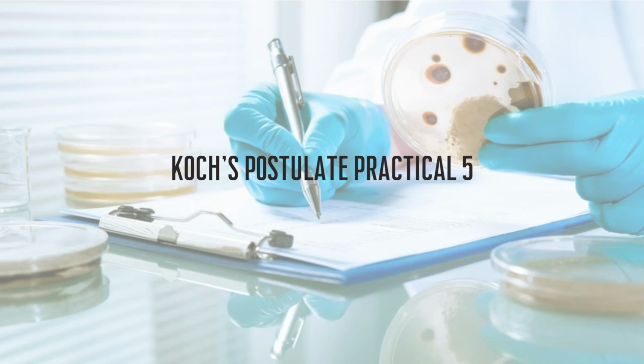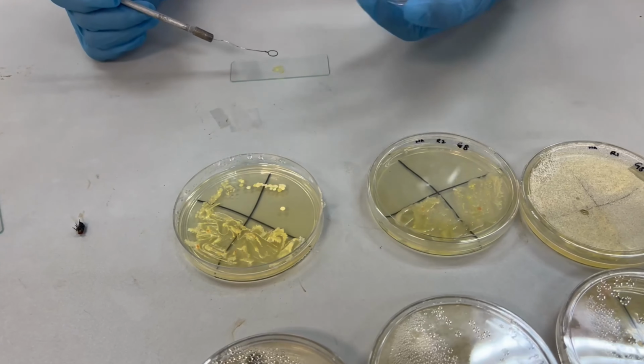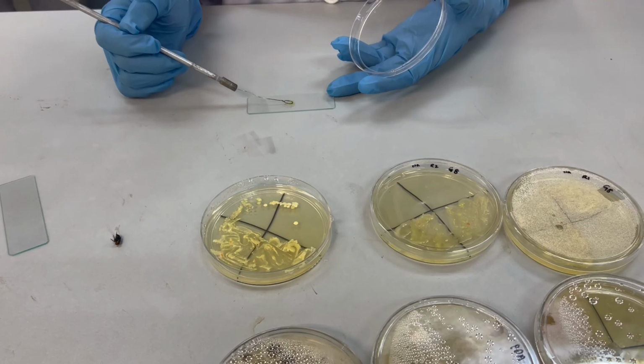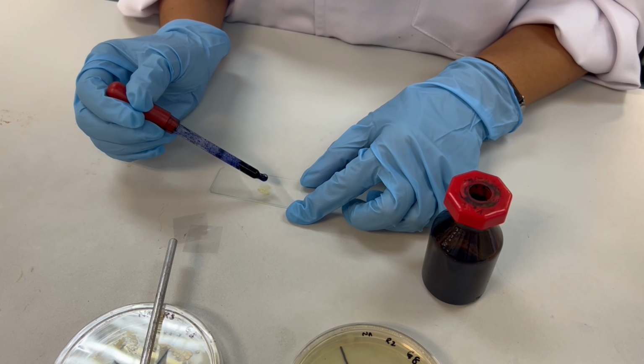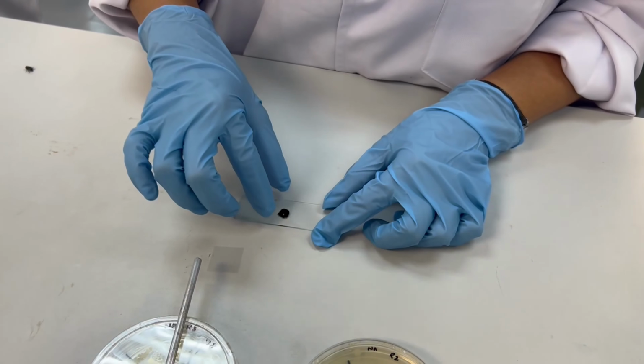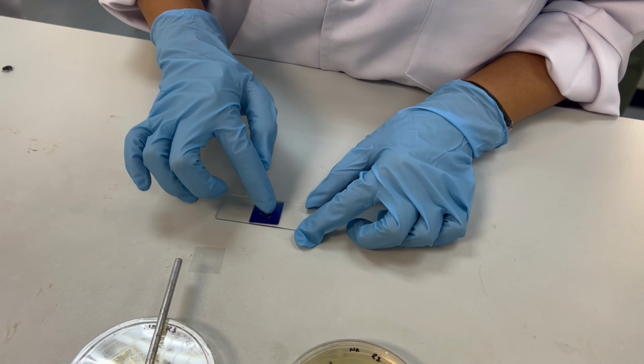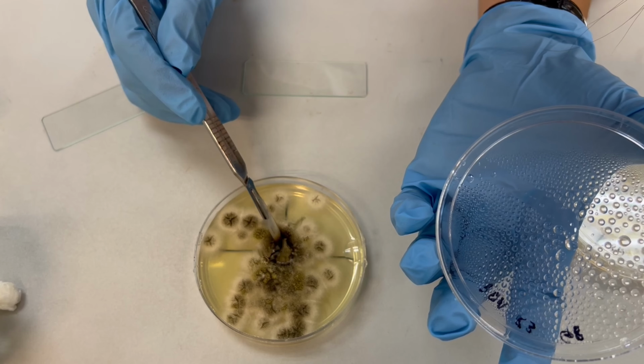Koch Postulate Practical 5. A sterilized inoculation loop was used to smear the bacteria on the surface of agar plates. A portion was placed on a slide, a drop of blue stain was added, and it was covered with a cover slip before being observed under the microscope.